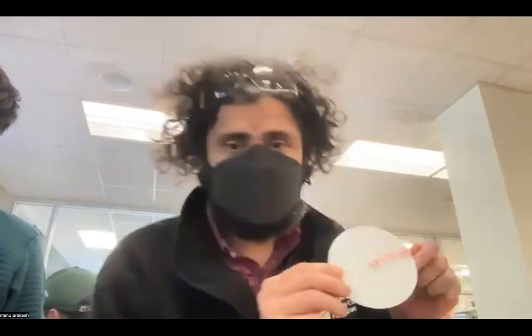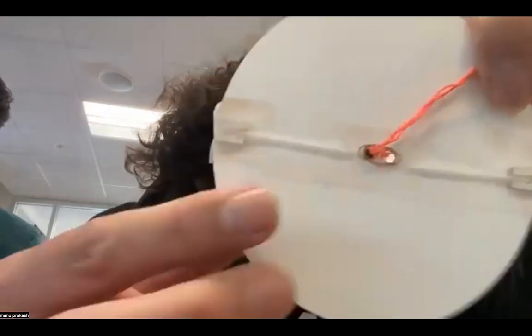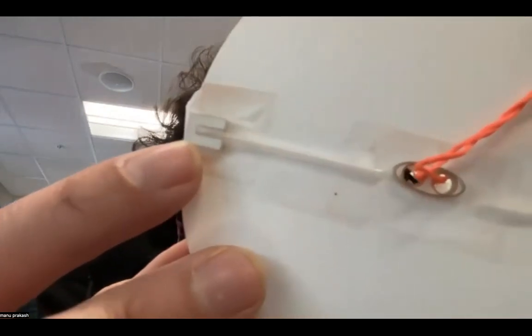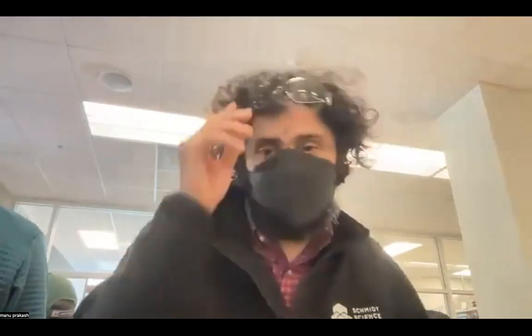So just folks that are still online. Now I've added the two capillaries, and what's very important is that little stopper. That essentially makes sure that the capillary is not flying around, because you don't want it to fly away, that would be really bad.